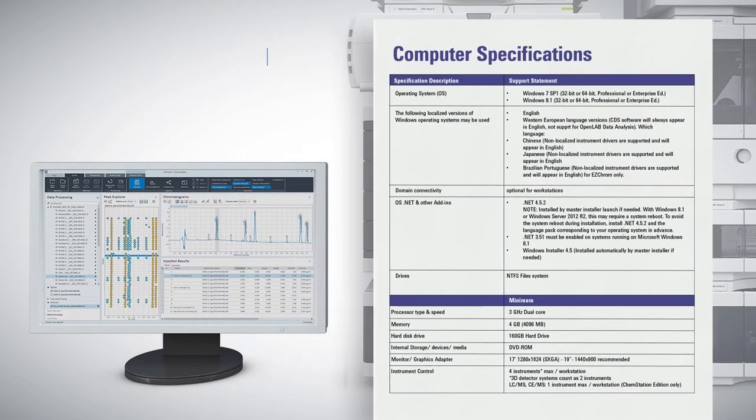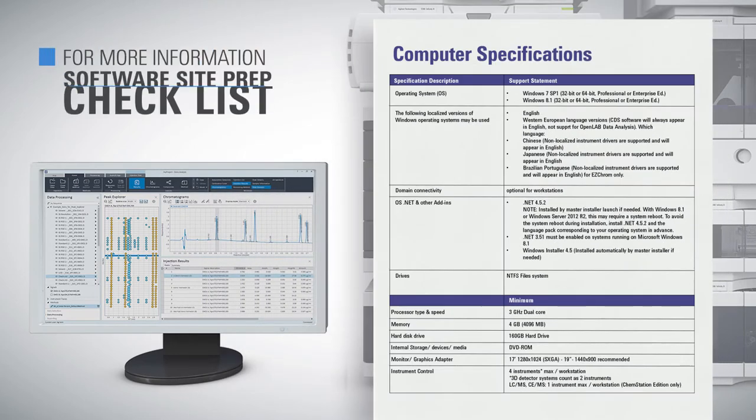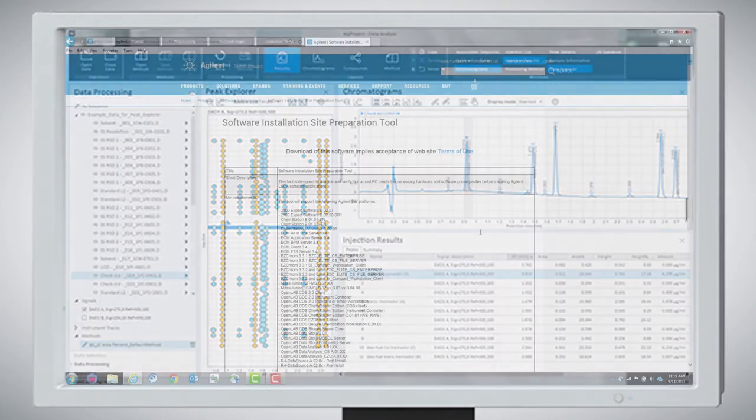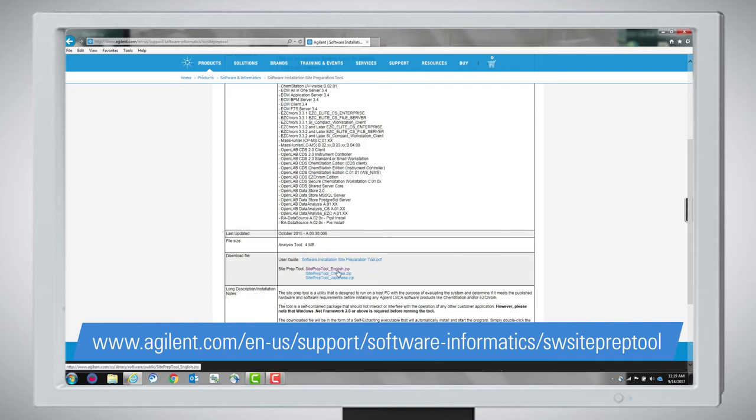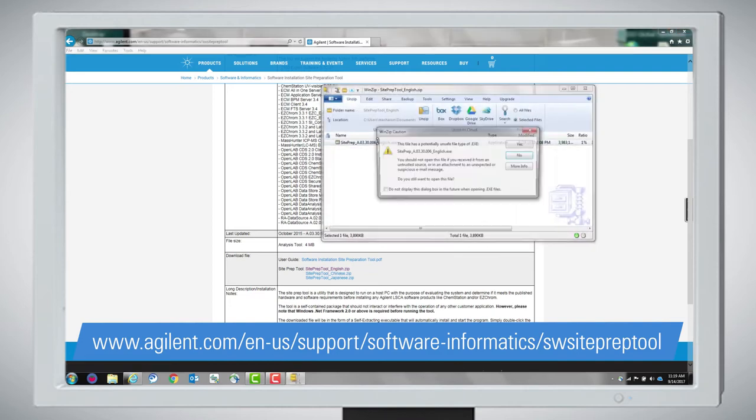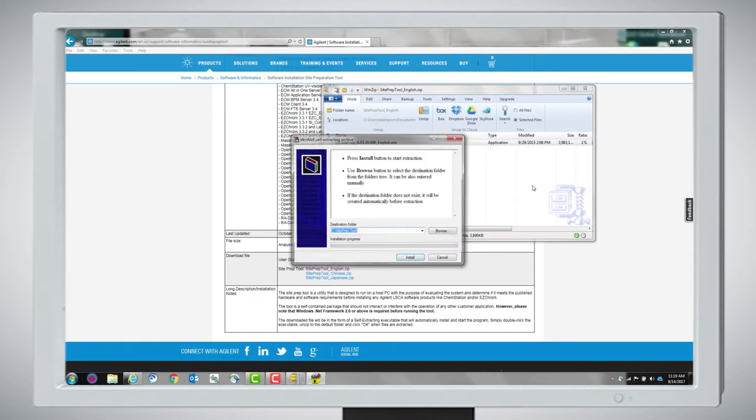You can find these tables and more information on software requirements in the software site prep checklist. Once you have identified the PC you will use, navigate to the link supplied by Agilent in your software prep guide and download and run the software installation site preparation tool.